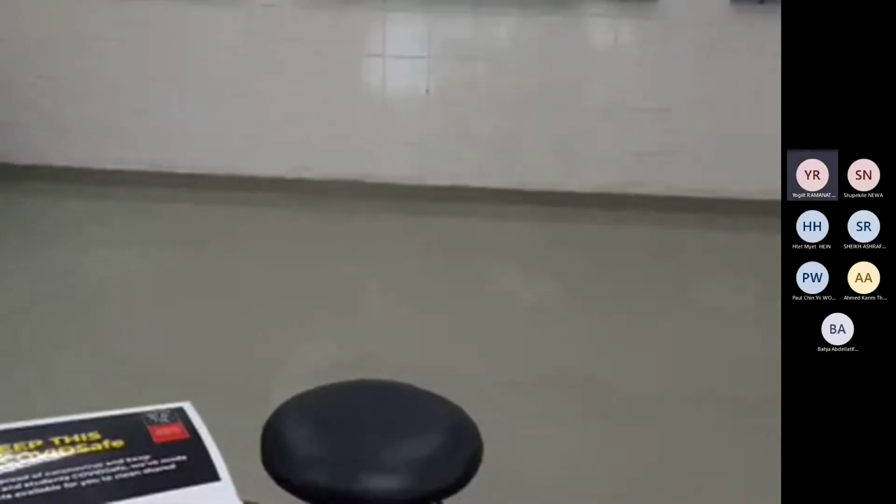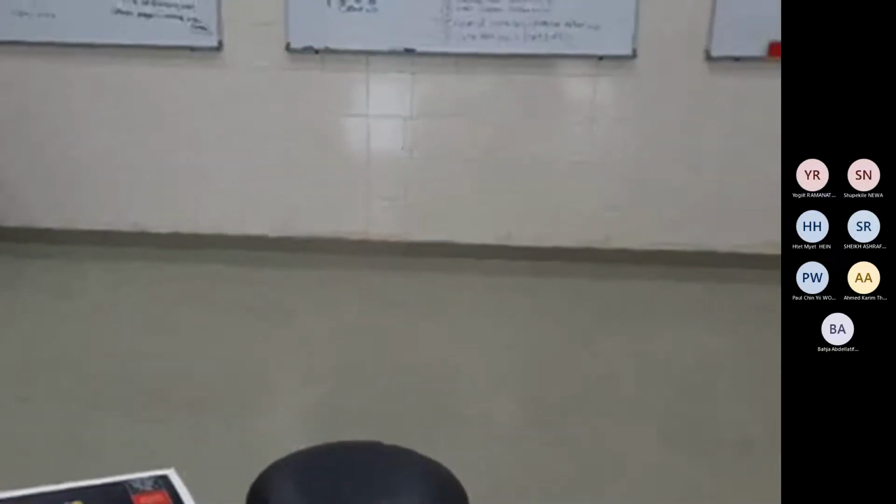So the pen ink should be on one paper, and your food dye and unknown should be on another paper. Yes, sir. I don't think I have my ink paper. So you ask your group member to send it for you then.